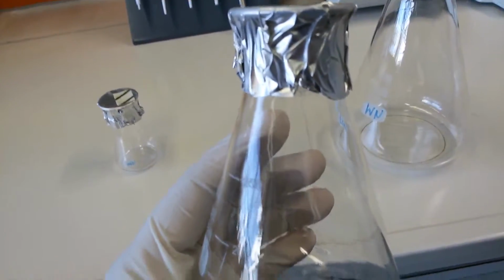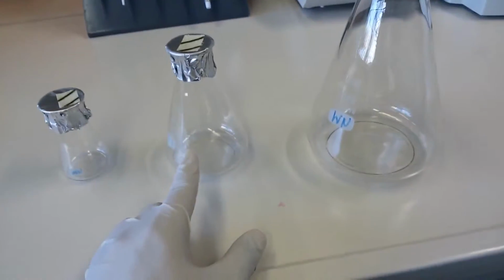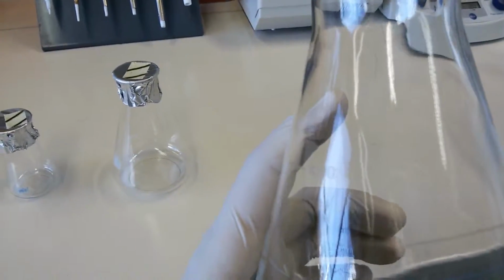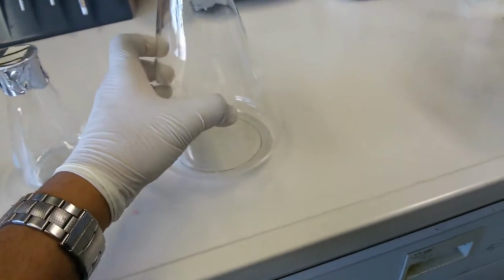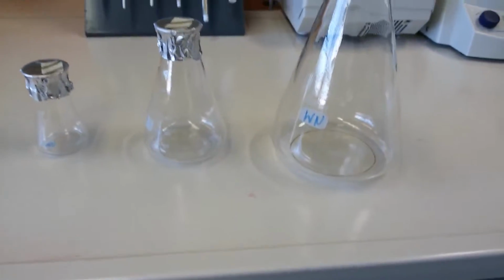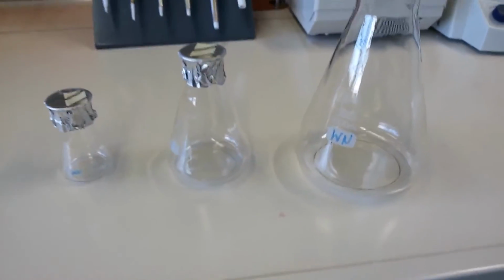This is 250 ml. We use it to grow 50 ml of culture, and then you can see again here, it's 1 liter, and we grow not more than 500 ml of culture in this. Great. So this is the third set of utility that you should know.